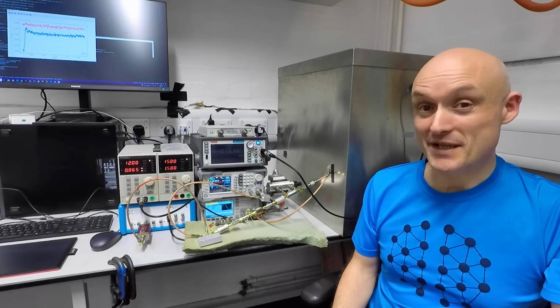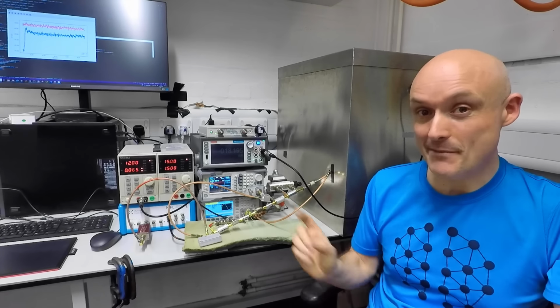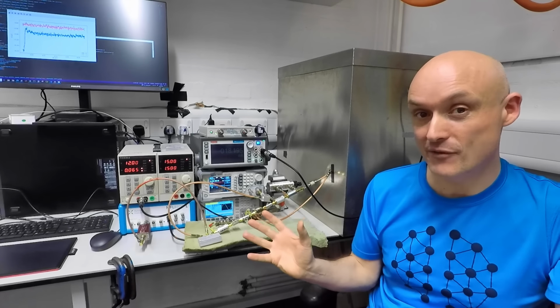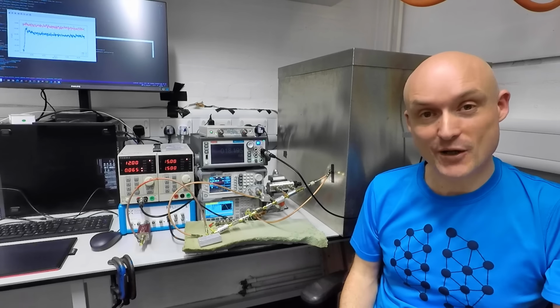We are in the lab today and we're going to talk to you about our continuous wave radio frequency EPR spectrometer, about how it works and how we put it together from instruments and components here on the bench. Now I say we because I'm not on my own today.